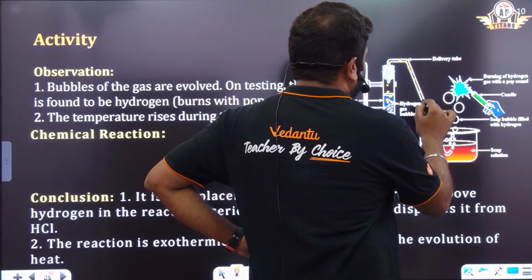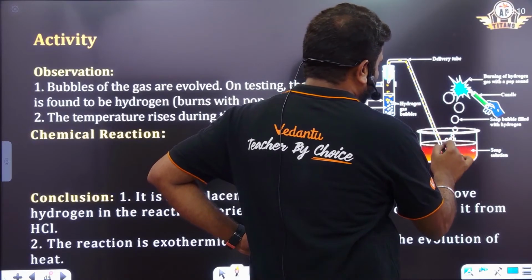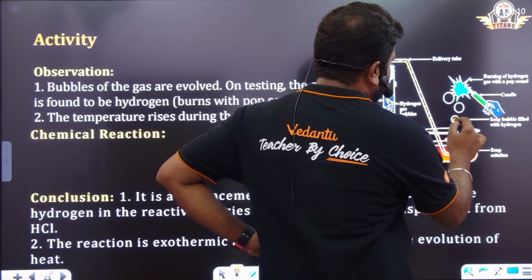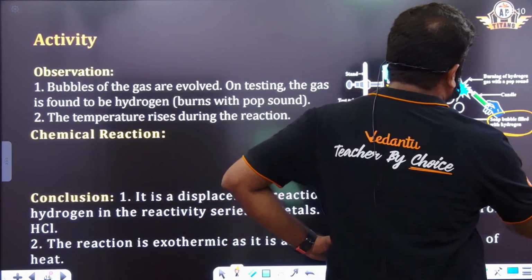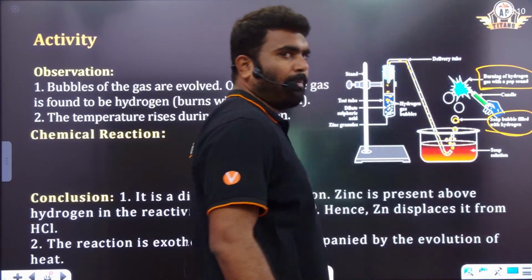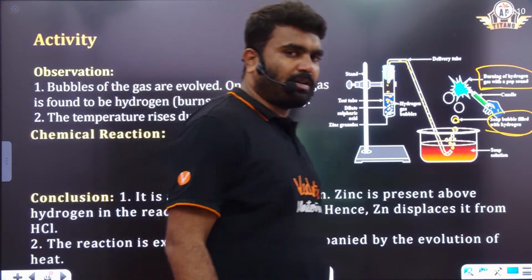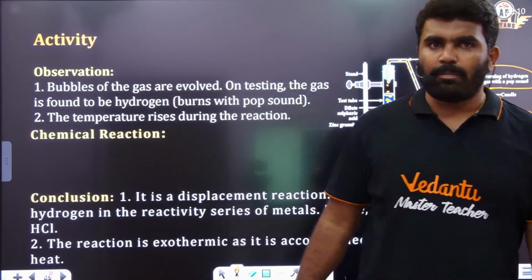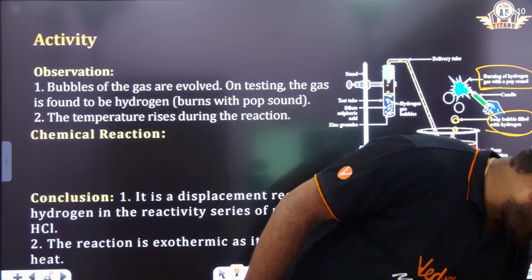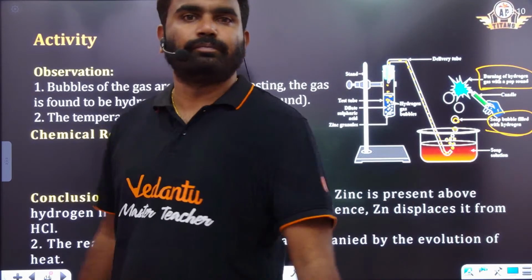So like this hydrogen gas bubbles will be coming, like soap bubbles. The soap bubbles filled with hydrogen will burn with a pop sound. It produces burning of hydrogen gas with a pop sound.